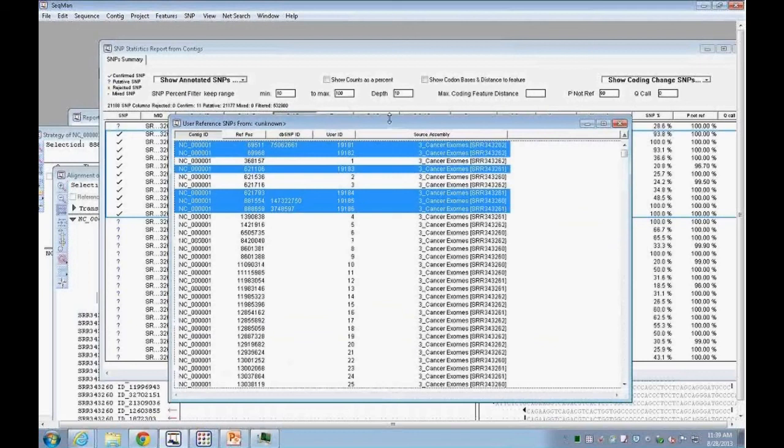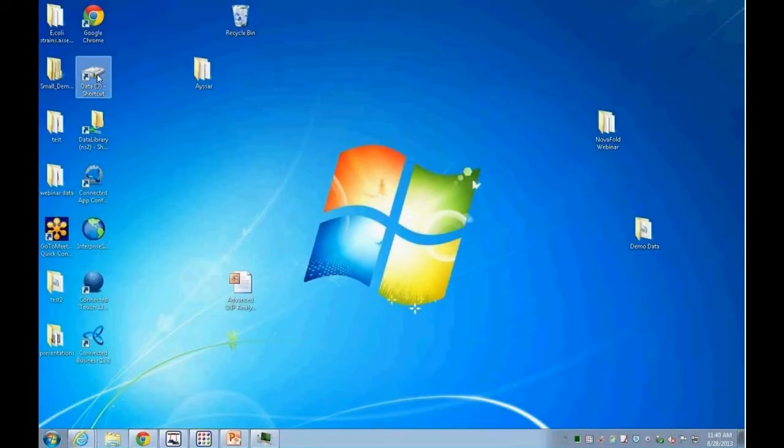Now, we had the question about the genome template package. If you didn't use a genome template package to start, you'll get a window that says you didn't have a genome template package. Would you like to create one? And then you can say yes, and it will auto-create a package, and then it can write this custom database file. So this file is being written down.